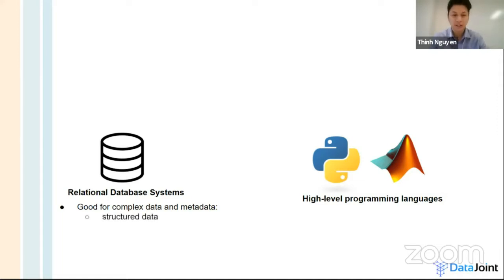They offer structured data. Everything is captured in tables with attributes and dependencies. Relational database systems ensure data integrity and enforce it. So an entry in a downstream table can exist only when there's a corresponding upstream entry, right? You have to have an animal before you have a session, something like that. As you went through yesterday or the day before in the workshop with David, I'm sure you've already seen that firsthand.